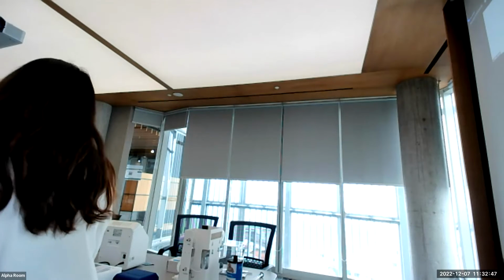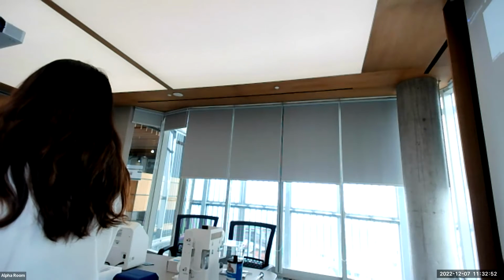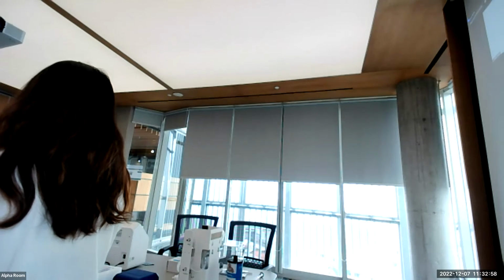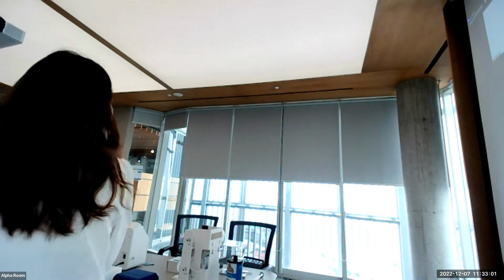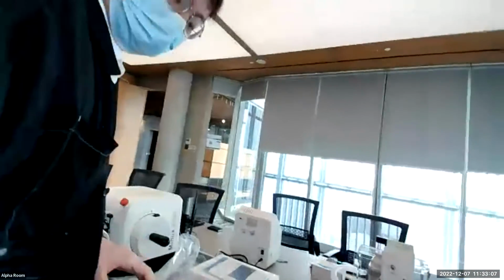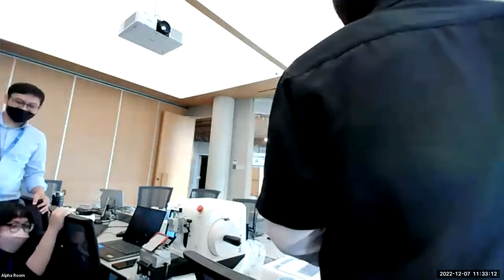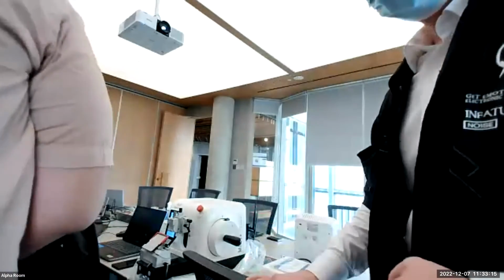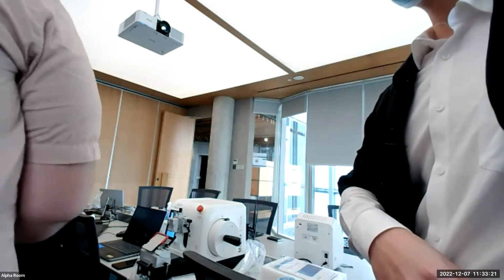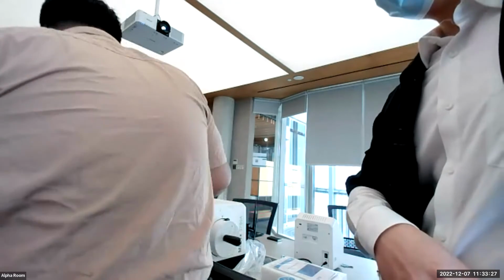Oh, oke. Biasanya, jadi kalau setengah itu untuk apa sih? Baliknya. Jadi setengah putaran untuk turun, setengah putaran untuk naik. Biasanya kan satu gitu kan langsung semuanya. Nah ini tadi dia setengah dulu. Oh, setengah itu untuk turun, untuk putaran untuk naik.